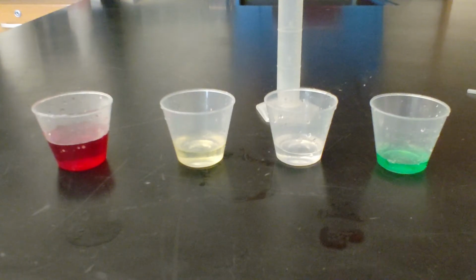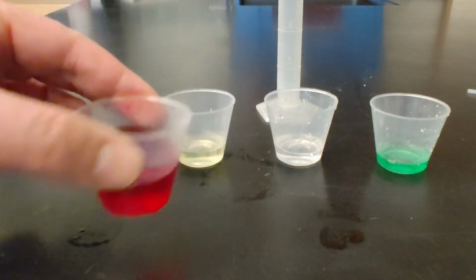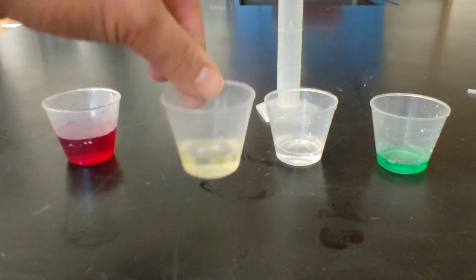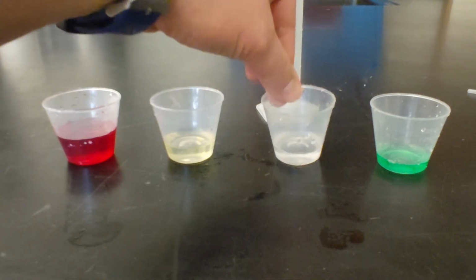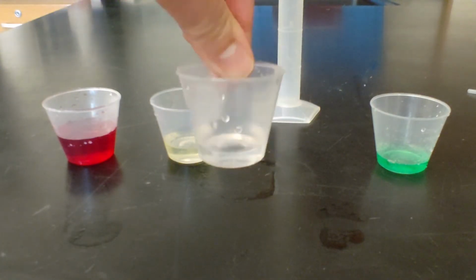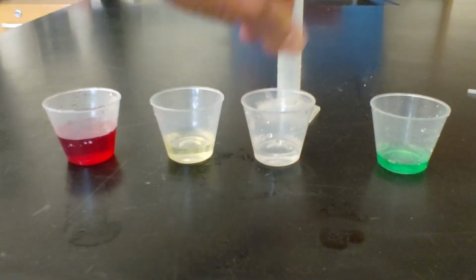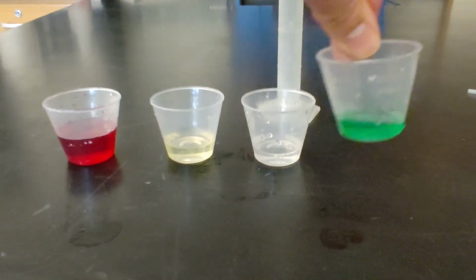So with this we have water, which I have put a little food coloring in. We also have right here, this is some vegetable oil. I have some glycerin, which is often used in health and beauty products. And then the last thing is I just have some dish soap.